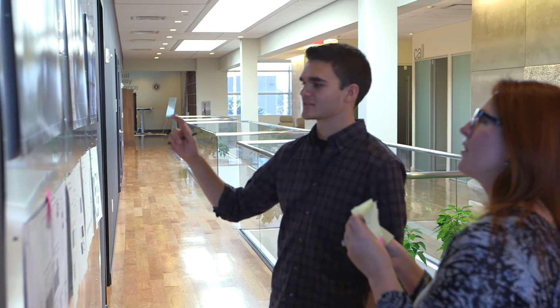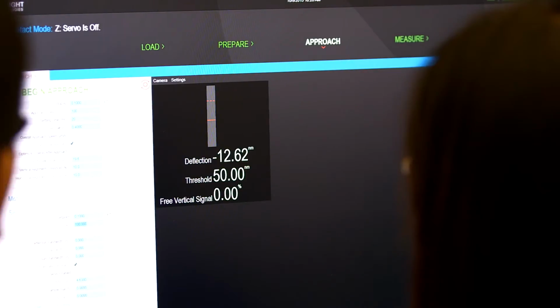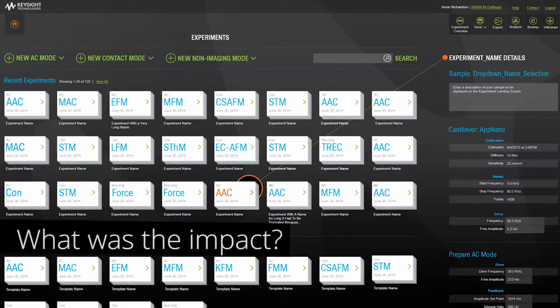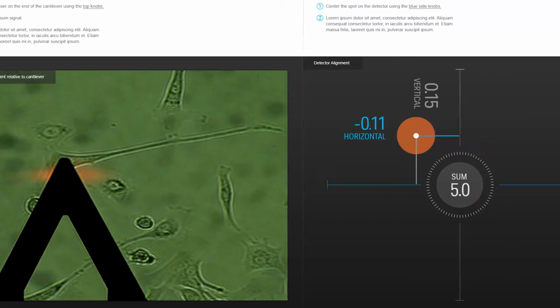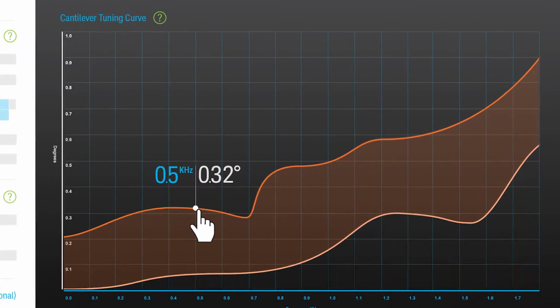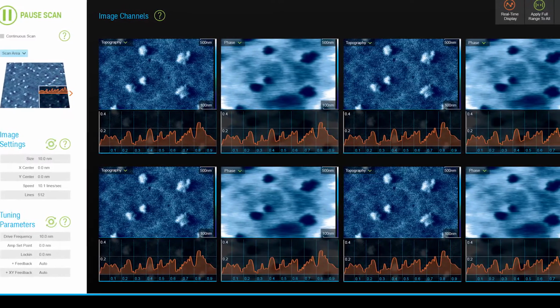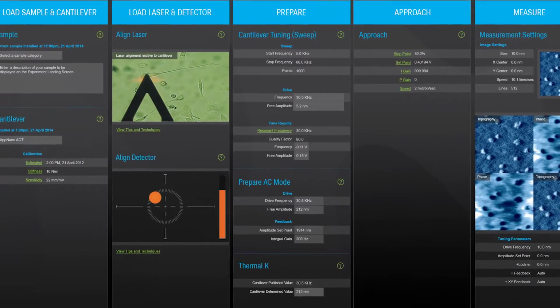And finally, we were designing for a new group of commercial users who would only be using the device for specific industry-related tasks rather than long-term scientific research. From a strict design perspective, we demonstrated to a very traditional user population the value of a true design process. We were also able to provide alternatives to the poorly designed software they currently use and deliver a useful, usable, and visually striking piece of scientific software.